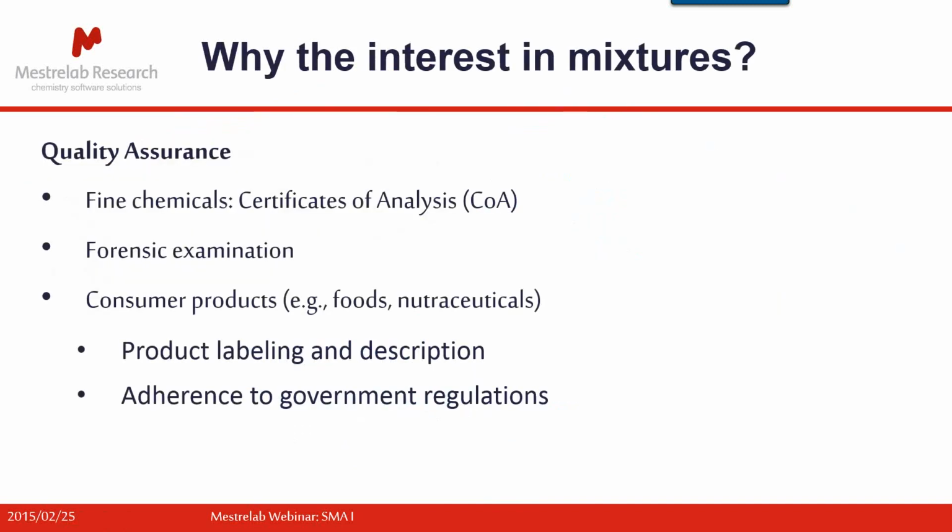So why the interest in mixtures? I think it largely comes down to quality assurance, if you want one name under which to put all of these various interests. And there are very many diverse reasons why mixtures analysis might be interesting to you. If you're living in the world of fine chemicals, then you probably want to deliver with your product some sort of certificate of analysis. The fine chemical might be something that you buy out of a catalog, or it might be a drug substance, an active pharmaceutical ingredient, API.